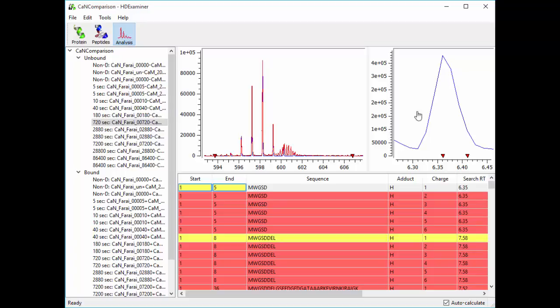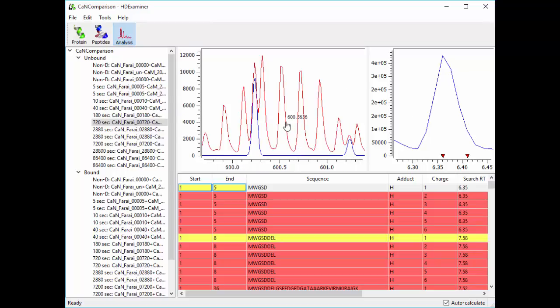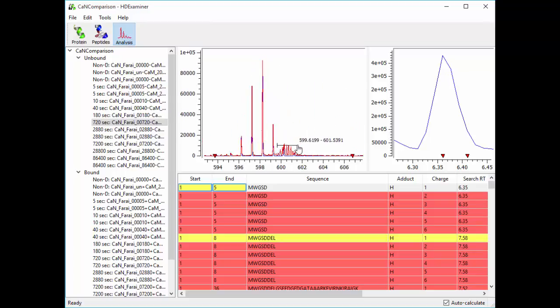And as a result, this interfering cluster that's been our nemesis through this whole situation is now really small. It's now closer to 10,000 intensity. So we've increased our signal to noise greatly by using the complete algorithm. And that's what it's there to do, is to do a bunch of extra calculations and find a better result in these really thorny cases where there's something interfering that we have to get rid of.